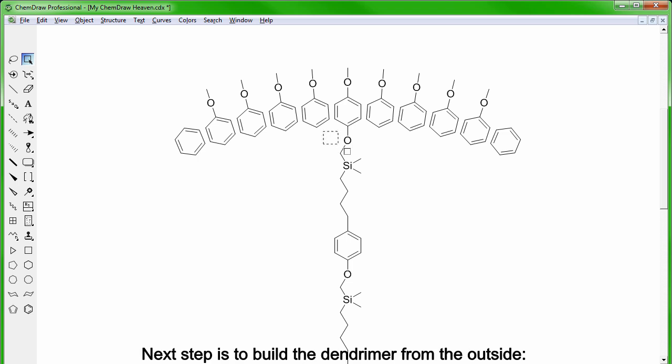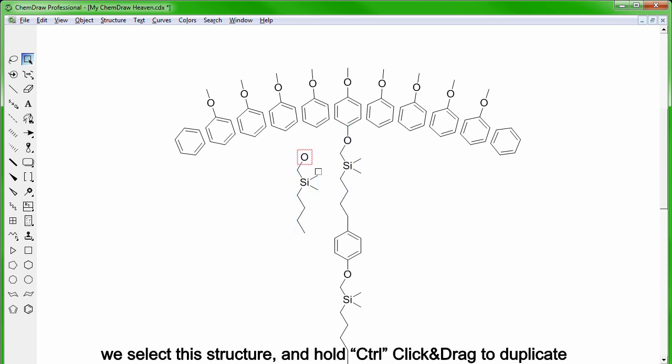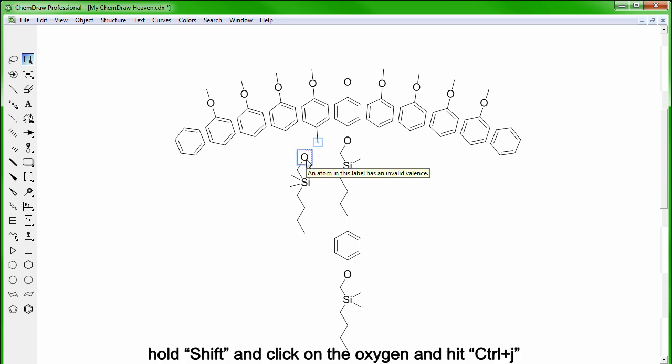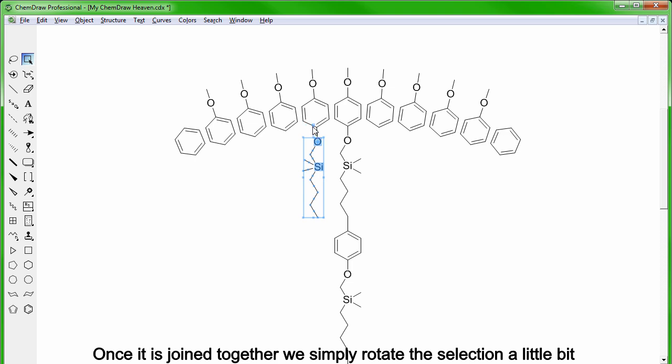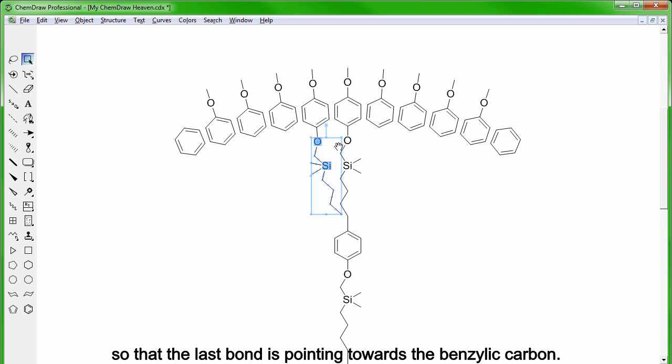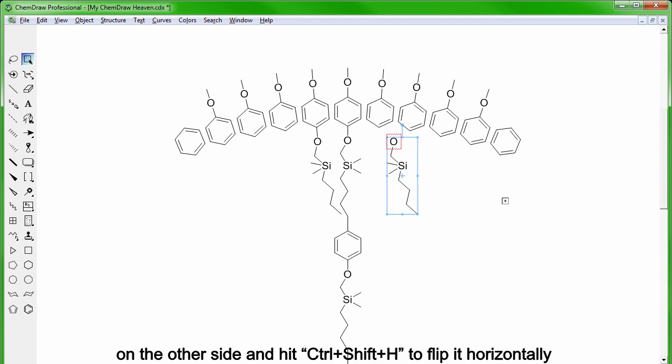Next step is to build the dendrimer from the outside and to do this we select this structure, hold CTRL, click and drag to duplicate and readjust the methyl groups here. What we do is to sprout a CC bond here, click on the carbon atom, hold SHIFT and click on the oxygen and hit CTRL-J to join. Remember the first one selected does not move. Once it is joined together we simply rotate the selection a little bit so that the last bond is pointing towards the benzylic carbon. Once that is done we hit CTRL then click and drag the selection on the other side and hit CTRL-SHIFT-H to flip it horizontally.